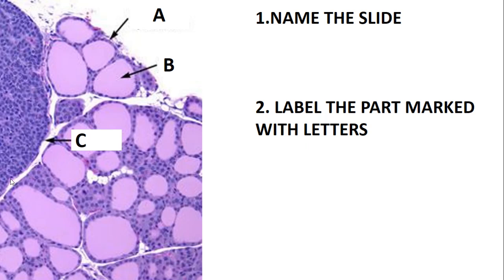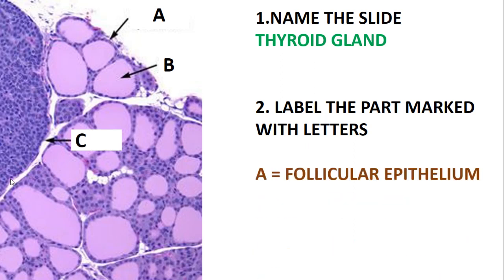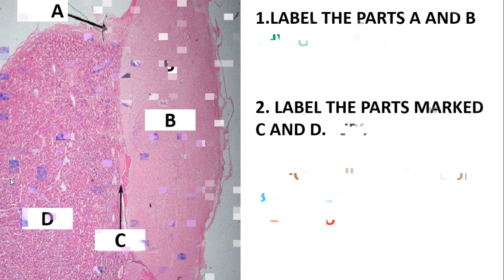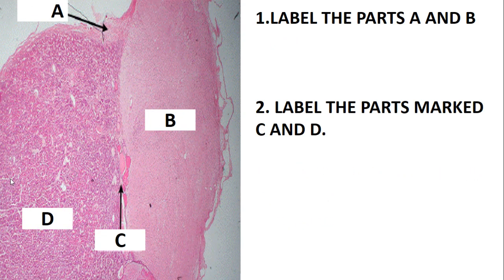This slide contains both the thyroid gland and the parathyroid gland, but the part we are most focused on is the thyroid gland. Label the parts marked with letters: A is the follicular epithelium, B is the colloid, and C is the capsule.